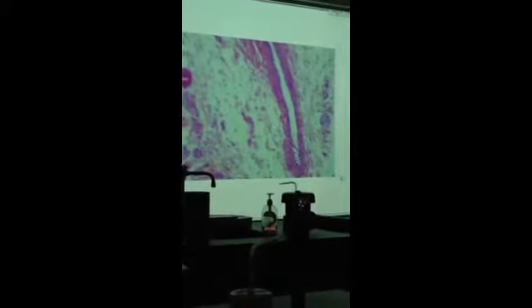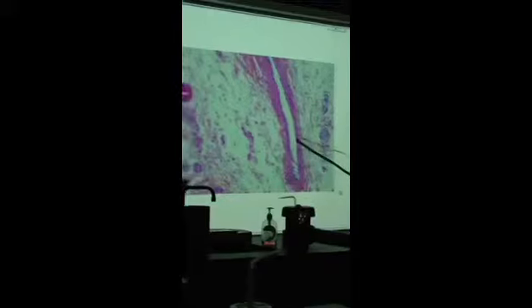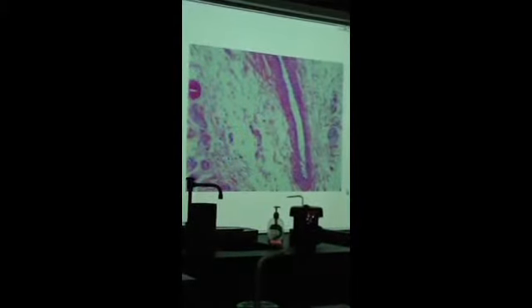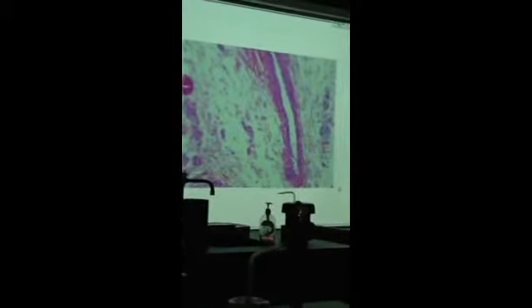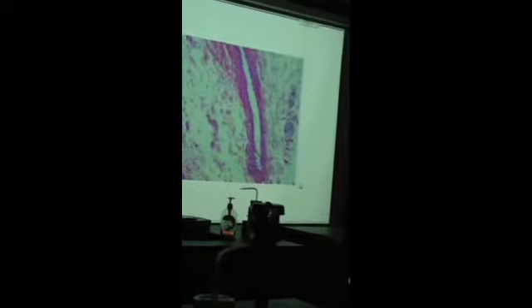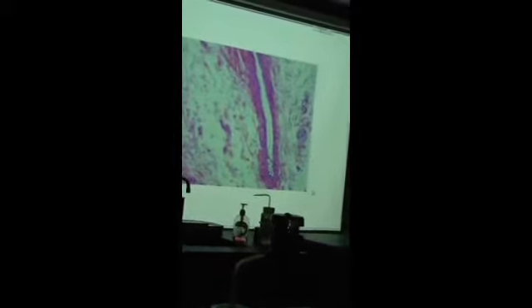As I said, veins, when there's no blood in them, tend to collapse, or at least be partially collapsed. So this is a vein. You can tell it's a blood vessel because these nuclei are flat, indicating simple squamous epithelium, which is the lining of all normal blood vessels, veins and arteries, and even capillaries. These salivary gland ducts, the small ones would be simple cuboidal epithelium. The larger ones would be stratified, but none with squamous epithelium.